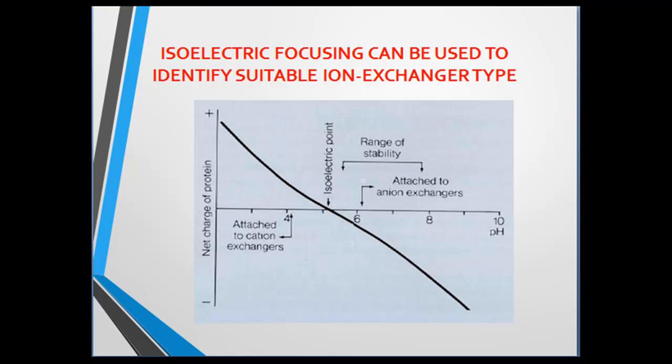The operating pH also determines the type of exchanger to use. A strong ion exchanger support maintains capacity over a wide pH range, while a weak one loses capacity when the pH no longer matches an acid dissociation constant of its functional group.